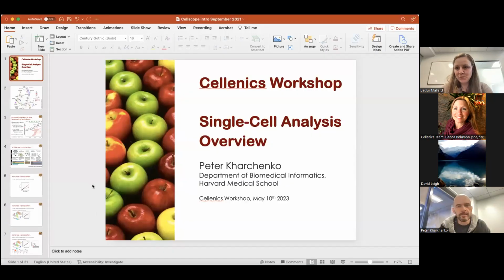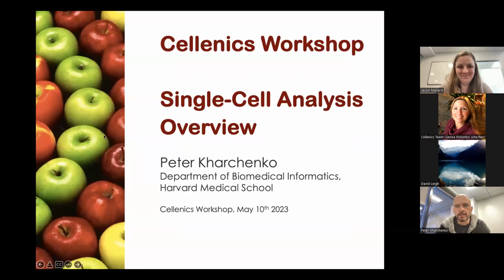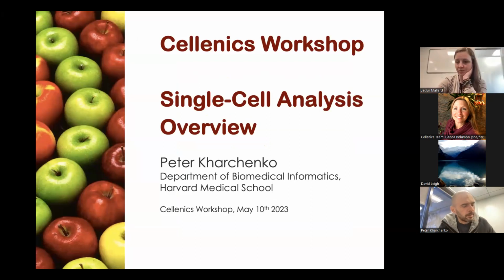Yeah, so I'll just say a few words and give a quick overview of some of the basic steps. The general idea is that single-cell data presents a number of computational challenges for analysis.